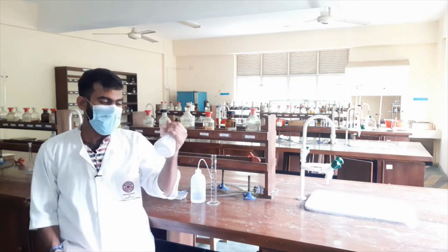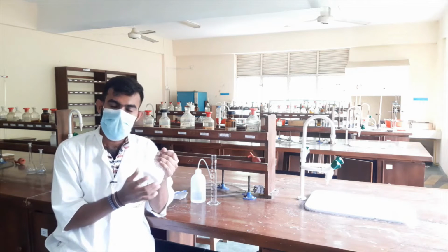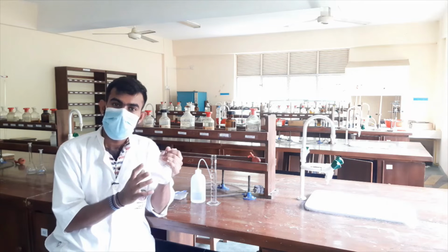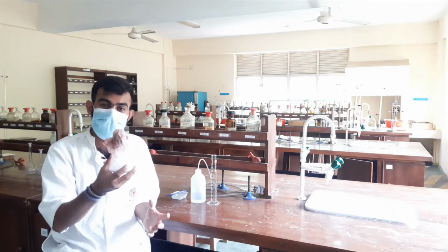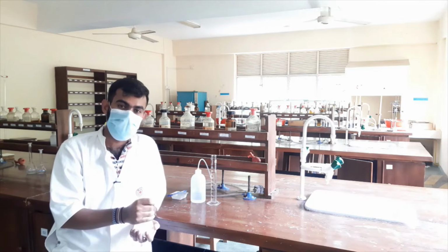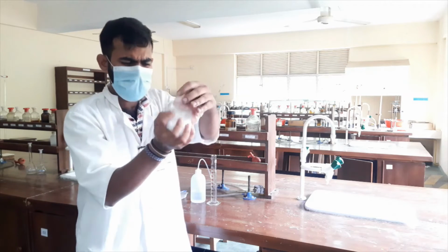Okay. Now I have my mixture. I first added one type of silica gel. Onto that portion I added another portion of the second type of silica gel. But the mixture is not homogenized yet. So before adding water, we have to mix it very well, and we have to make sure that both powders are in a homogeneous position. So I will mix it very well. I have to hold it very tightly, and I can mix it like this.